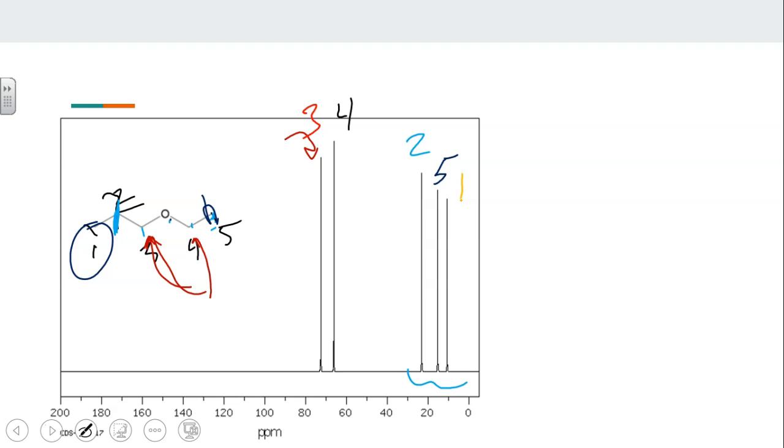And again, I'll let you go about trying to write up what I'm saying. But the idea is you want to make sure you address every peak and apply it to each of the ones in the compound. Okay, and then by doing that, I also think that if you're wrong, it will show up. You'll be able to say, oh my gosh, there's 5 peaks, but I only have 4 different carbons. Or this is a triplet, but it should be a quartet, or this should be a singlet. Maybe I need to go back and look and see if this is really the product. And that happens all the time in interpretation.